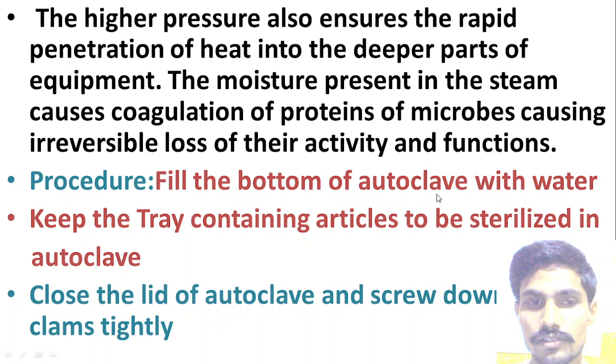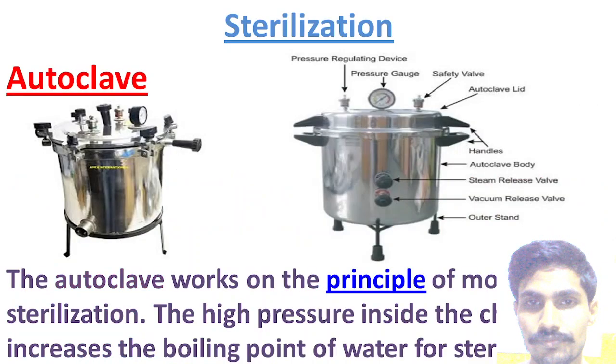And screw down the lid clamps tightly. Means there are lid clamps. This also is a lid clamp, this also. You have to screw them down tightly.